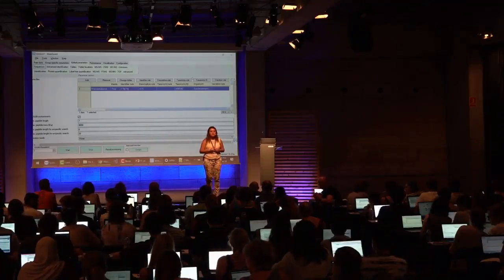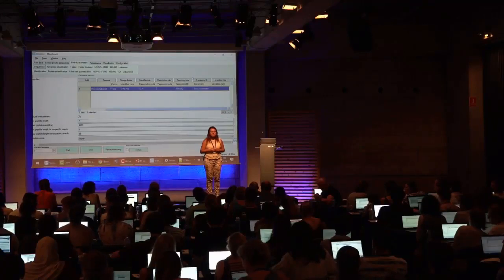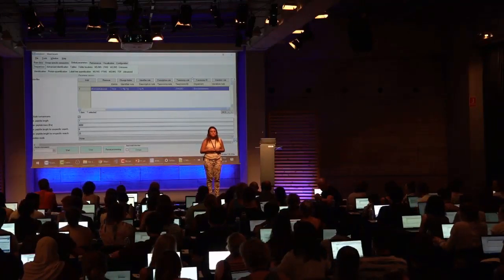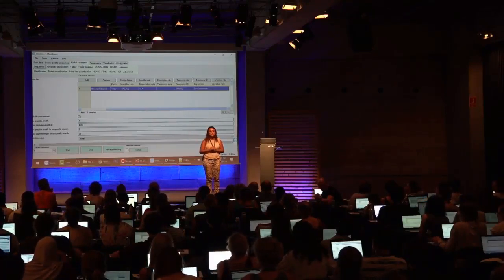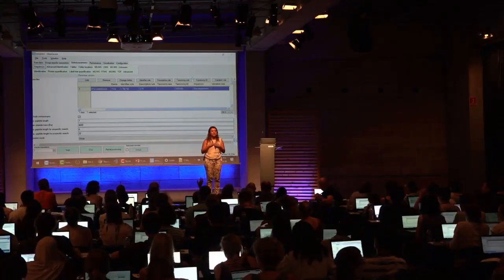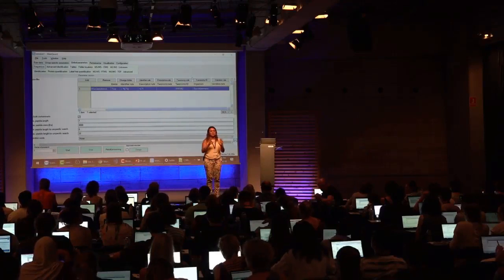Yes. Hi, one question. In the FASTA folder that we got on the USB, with the same number of FASTA files, there is one and another one that says additional. So this will come for the next tutorial. Sorry. So we use the normal one, not the additional. Yes, but my idea is to show you how you could actually upload the FASTA file. It doesn't matter which one you choose.